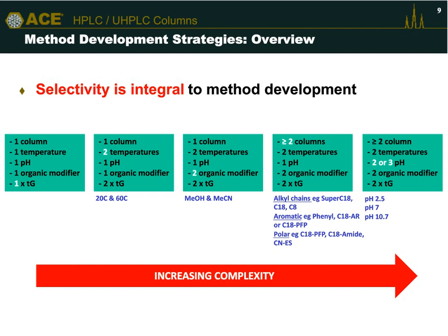Now, as we move from the left-hand side of the slide to the right-hand side of the slide, we do more injections, we generate more data, it takes more time, but we generate more knowledge as well. Rarely do we have the opportunity to explore all of these parameters to get a complete understanding of the retention behavior of our analytes in the mixtures, and so we must look to rationalize those parameters accordingly. So, of course, the question is, which parameters should we focus our efforts upon?